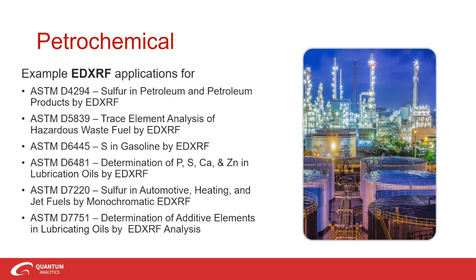For this type of analysis, a calibration is required. But the good news for you is that the calibration is only needed once, and that's usually during the installation of the instrument.